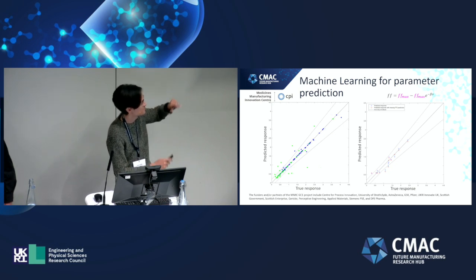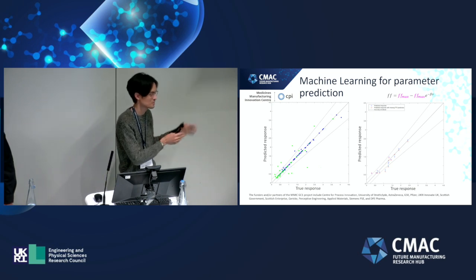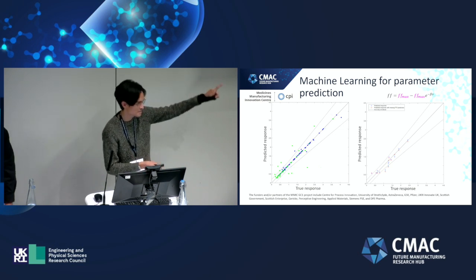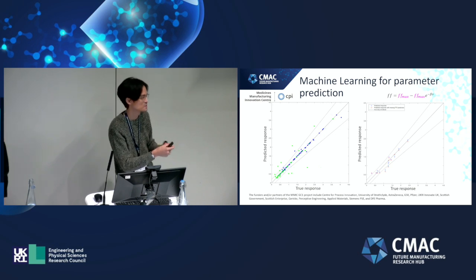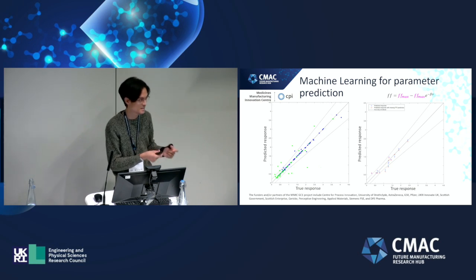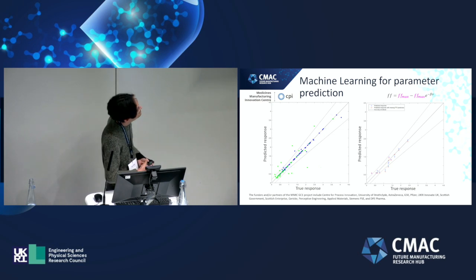As part of this analysis, I removed various combinations of inputs, some wholesale: okay, if we didn't have FT4 data, what would be the impact? Or if we just didn't have tap density, for example, what would be the impact? I don't remember specifically what this exact plot is, but I looked at various combinations of removing inputs. Obviously, some have more impact than others. There are some inputs that are key, and if you don't have those, it's not really going to work. But for many of them, there are varying degrees of impact. Many machine learning models will have a ranked importance of what they think is important based on what they saw as data. But in this plot you see here, a single input has been removed from each case. Cool. Thank you.